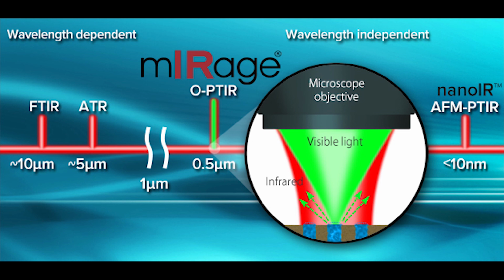So Kurt, there was a question about the bone measurements. Were the spectra acquired on a glass slide or another substrate? And maybe you can mention again the requirements or lack of requirements for a specific substrate. Yeah, the sample we looked at of the bone was exactly the same sample that the FTIR data was collected on. So it was on a barium fluoride window, but it didn't need to be for the Mirage measurement because we measured it in reflection.